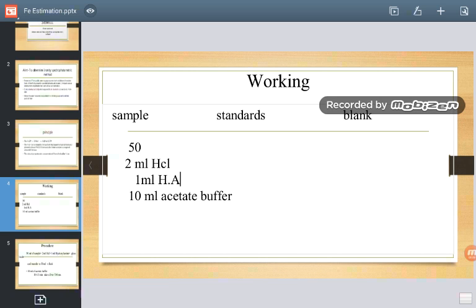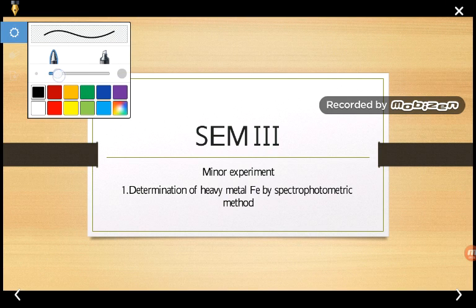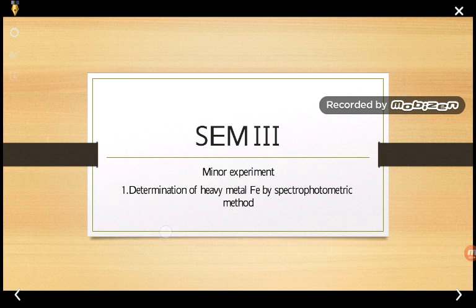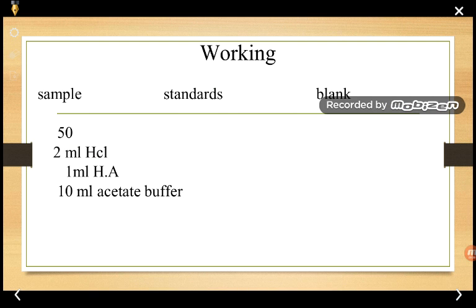Here we have to perform three procedures: one for the sample, another for the standards, and third is the preparation of the blank.